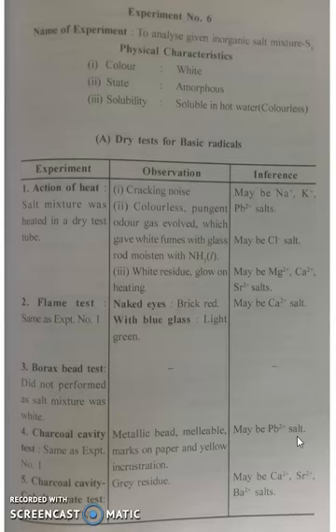Then you will observe white precipitate obtained. On the basis of that, you have to infer sulfate presence. That is the confirmatory test. Perform the next experiment: to a hot solution of salt mixture in dilute nitric acid, silver nitrate solution was added. If your observation is a white precipitate soluble in liquid ammonia or ammonium hydroxide solution, then chloride is present. This is the confirmatory test.